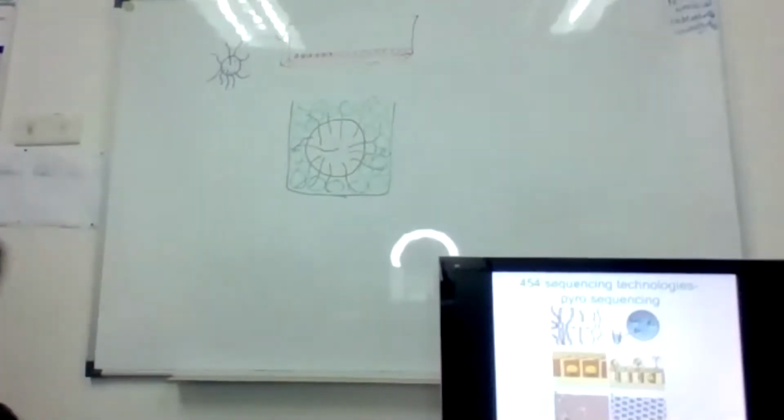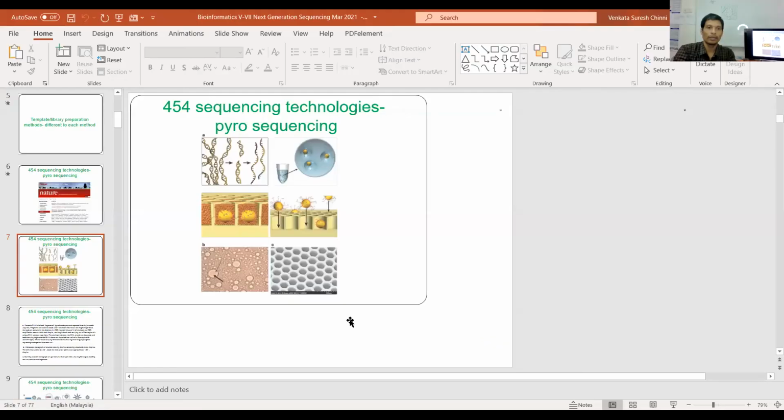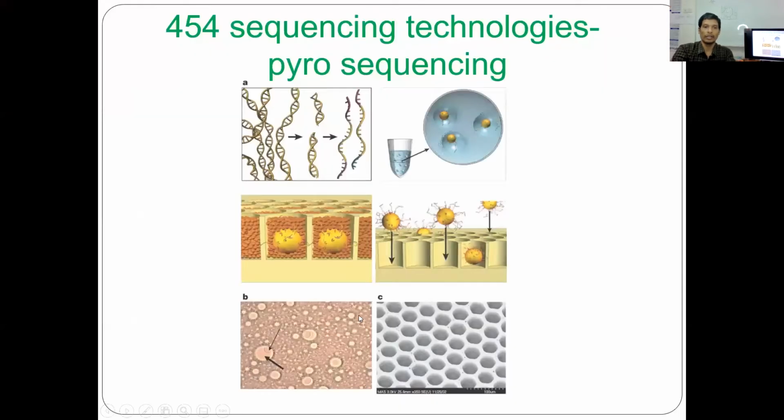Maybe I'll show you the slide. Yeah, you can see here. The first step, you already cut the DNA into small pieces.